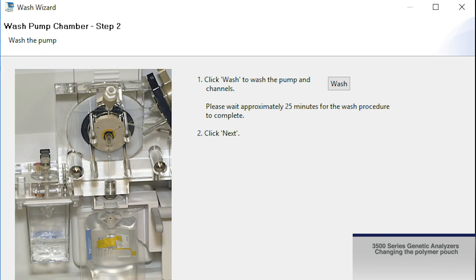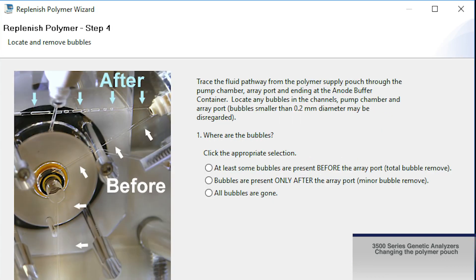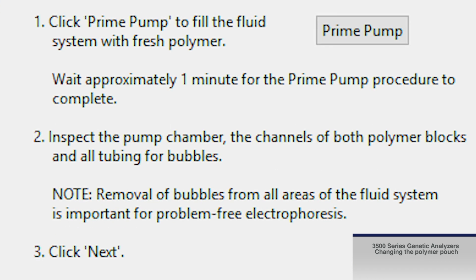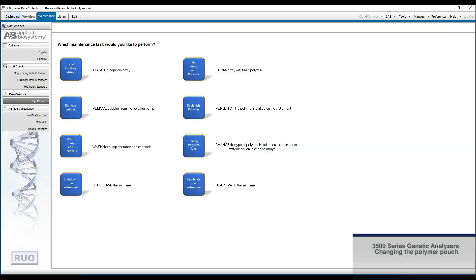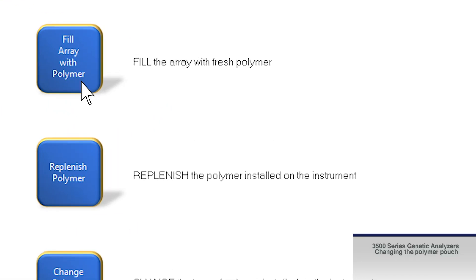Follow the wizard through the remaining steps of changing the polymer pouch. These include priming the pump with fresh polymer, visually checking and removing any bubbles in the pump chamber, and the option to fill the array with fresh polymer.